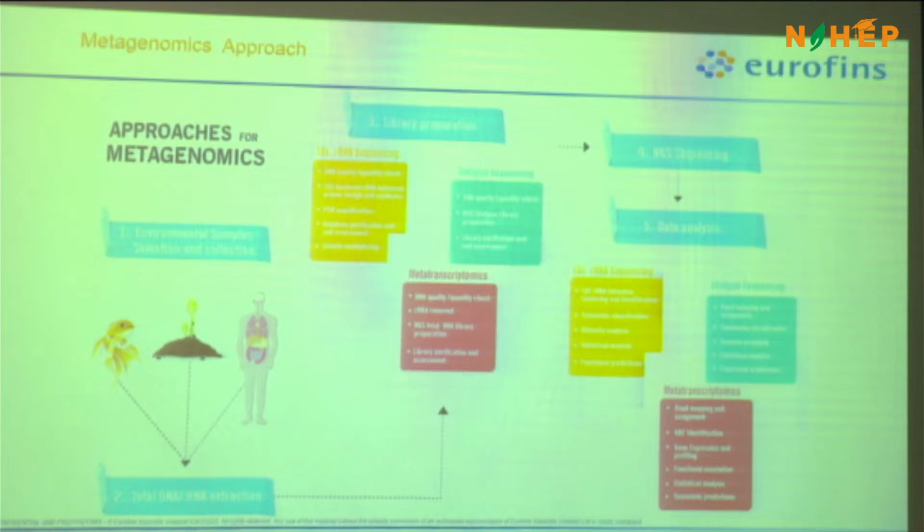Now, but in viruses, what is it? After COVID, many people are doing virome analysis, viromics, which is coming up. In plants or in soil, we are trying to identify what viruses are present as well. So how do we do that? We don't have a marker there. We don't have any option other than going with shotgun metagenomics.